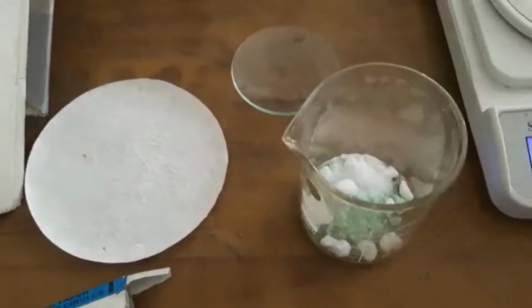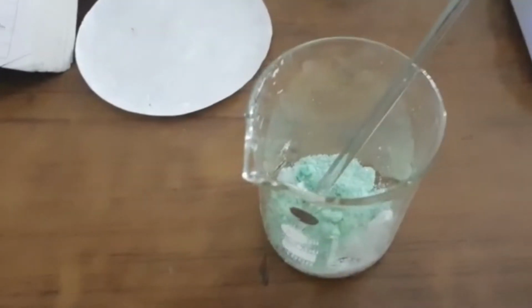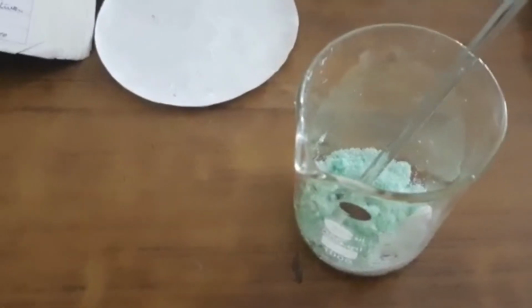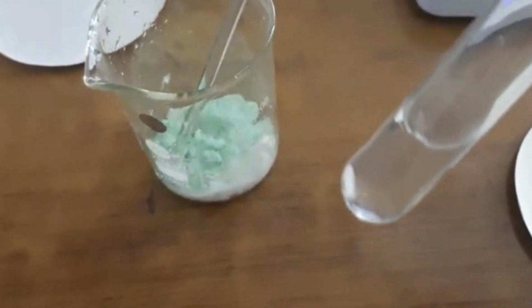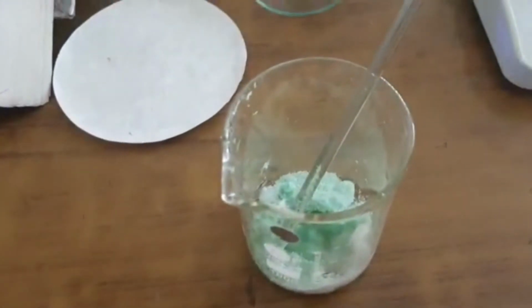To this 2 to 3 ml dilute sulfuric acid will be added. So to this mixture of ferrous sulfate and ammonium sulfate, I am going to add 2 to 3 ml of dilute sulfuric acid. This is added to prevent hydrolysis of ferrous sulfate to ferric hydroxide. To prevent hydrolysis, we are going to add sulfuric acid. So I am going to mix this, and now to this we are going to add boiling water.